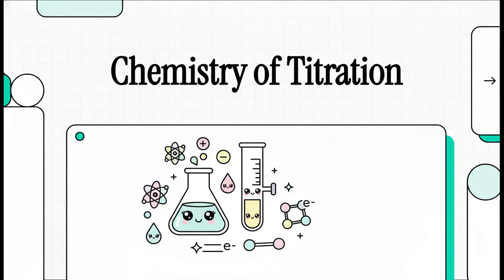Welcome to the Explainer. If you're a chemistry student, you know that figuring out the exact concentration of a solution is a huge deal. Well, today we're breaking down one of the most powerful techniques to do just that, titration. We're going to walk through it step by step so you can totally master the concept.